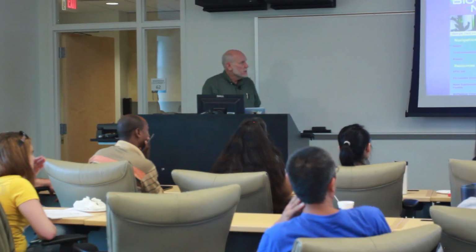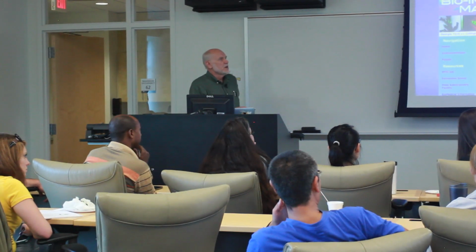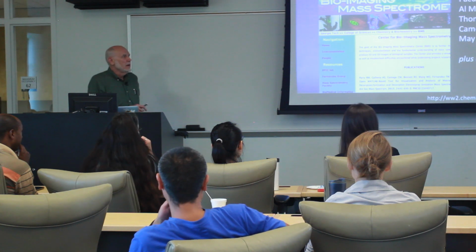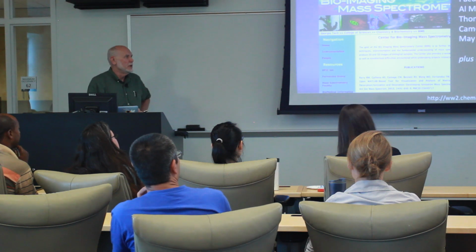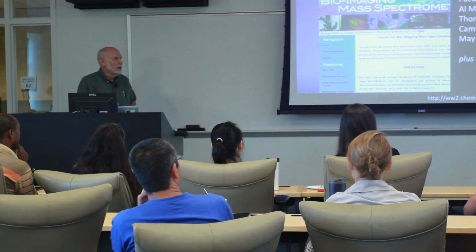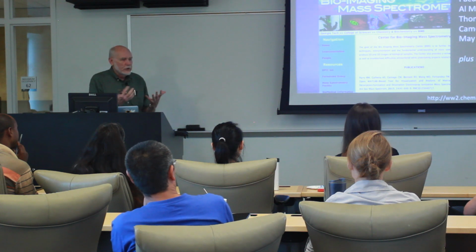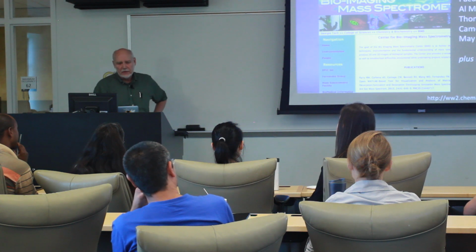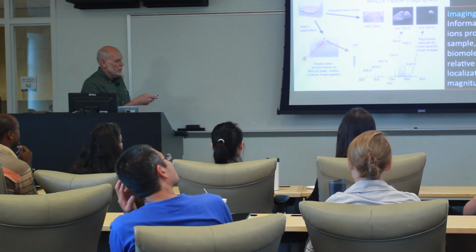About 5 years ago, we set up a bioimaging mass spectrometry center that was a combination of several of us who were using different techniques, Facundo, Cameron Sellards, and myself, to look at surfaces and the spatial orientation of molecules and biomaterials, but also bringing in people like Tom Orlando, who had ideas about novel ionization methods, and then Mei Wang in biomedical engineering to help us deal with the very large data sets that one obtains when you do this sort of technology.